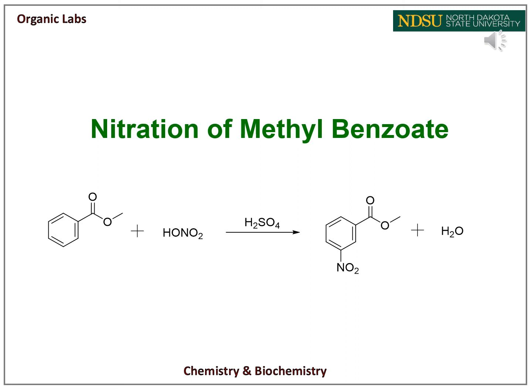Hello everyone. Today I'll be talking to you about the reaction we'll be doing in lab this week, which is the nitration of methyl benzoate. You can see the reaction scheme here, reacting methyl benzoate with nitric acid and sulfuric acid to get our product.